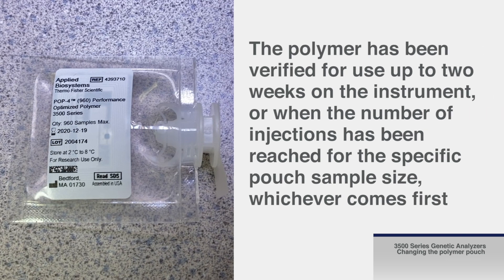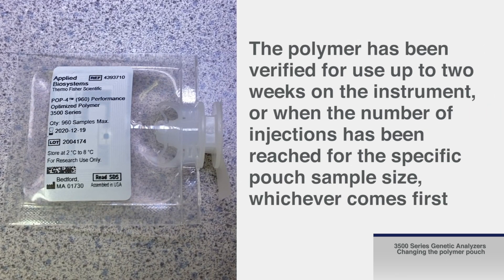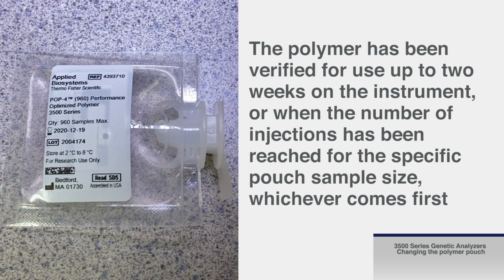The polymer has been verified for use up to two weeks on the instrument or when the number of injections has been reached for the specific pouch sample size, whichever comes first.